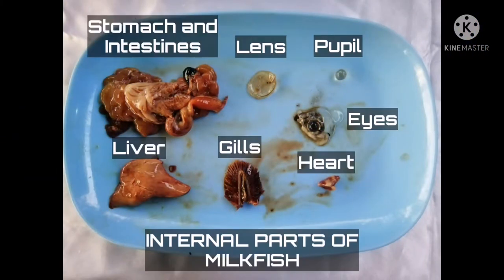This is the internal parts of the milkfish that includes its small intestine, stomach, liver, heart, gills, and eyes that includes pupil and lens.